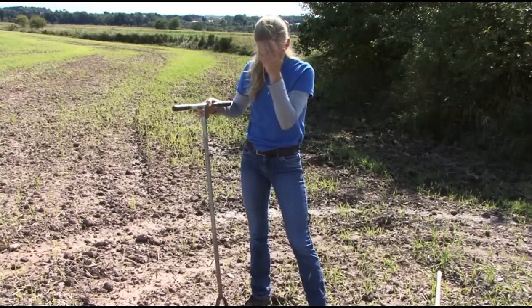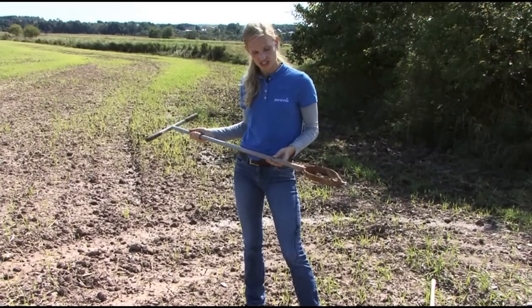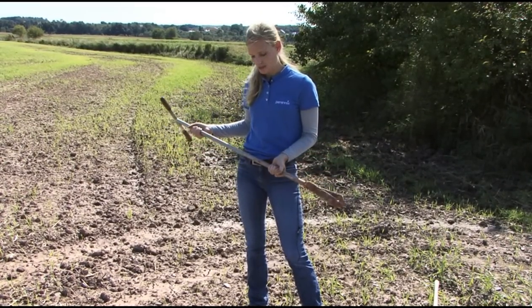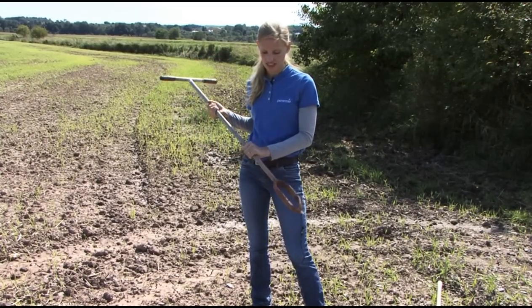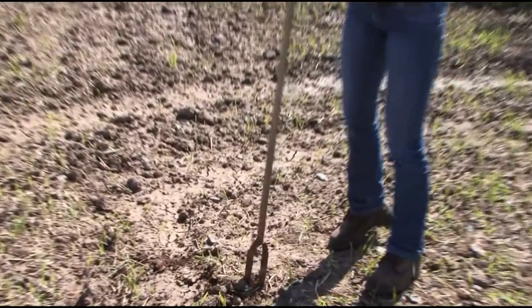The last tool I'll show you is called a Dutch auger. I don't use this a whole lot for soil sampling unless the ground is really hard to go through. This auger will pretty much sample anything. So if you've got ground that's a little rockier, those smaller soil probes — it's really tough to get a good sample. But these augers, as I mentioned, they'll go through just about anything.